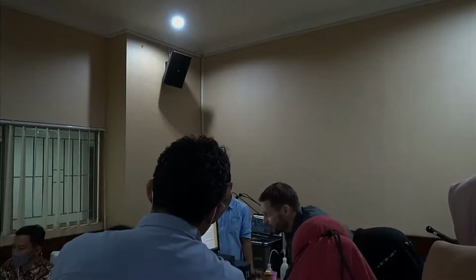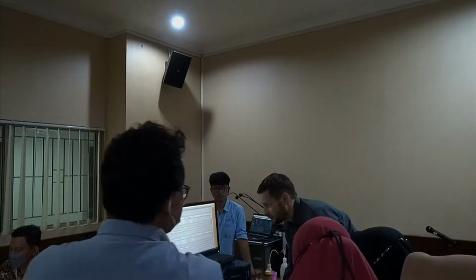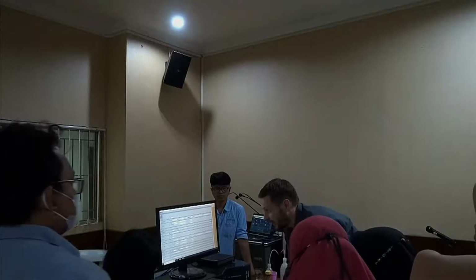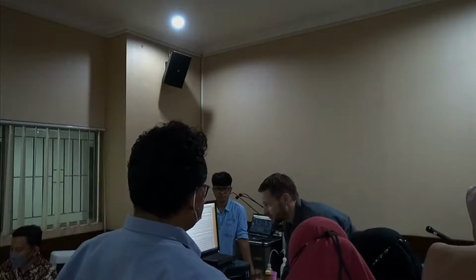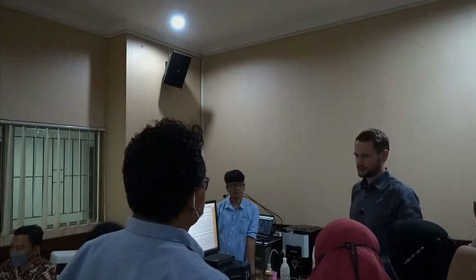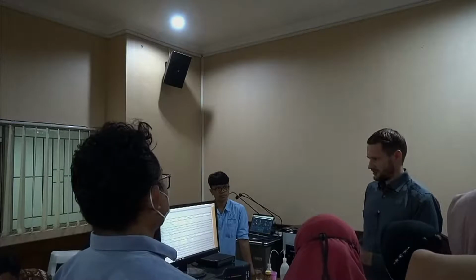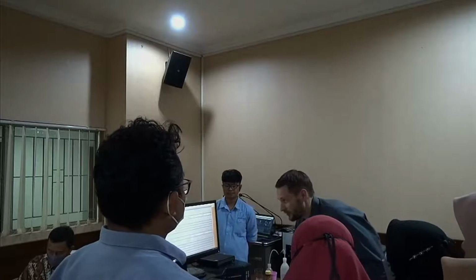So what we can do now is, you see, we start without ultrasonic. Then we will make 2 measurements. Then we will wait, maybe not 4 minutes, let's wait 60 seconds. And then we will make another set of measurements with ultrasonic power of 100. So we will have a comparison with the same exact aliquot, no ultrasonic, super strong ultrasonic. See what happens. Because we are now, after the first measurement, a little bit tapping in the blind. We observed something, not dramatic though, but we observed some change, and we're not sure where it comes from. So we take the next step. We compare a measurement with and without ultrasonic.